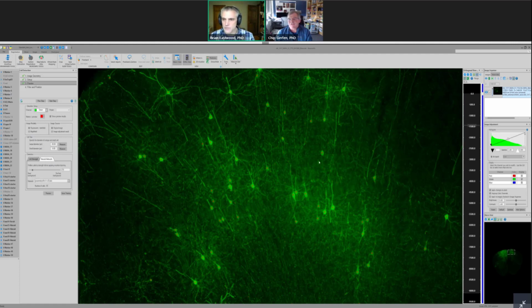So one of the things to notice, if you remember from what I showed before, when we ran this with just the cell strength value, even when we increased the threshold, we got a point where we could see the very brightly labeled pyramidal neurons, but the dimmer ones were oftentimes lost. And so this enables being able to detect brighter and dimmer neurons, across a wider range of neurons that have different levels of intensity.